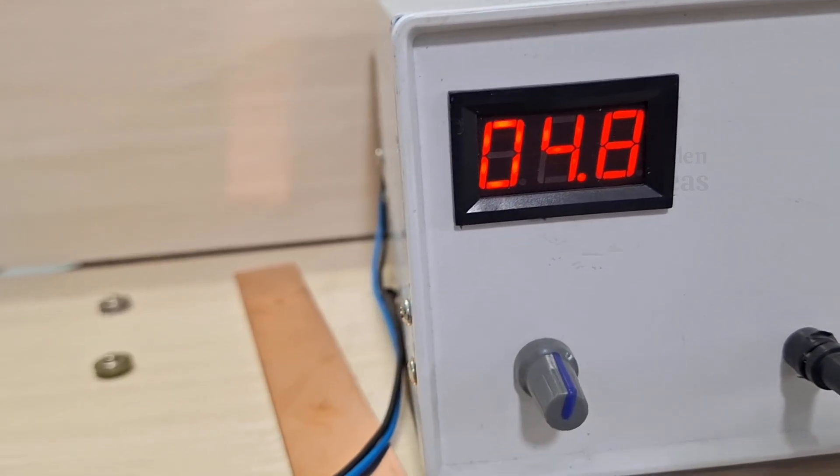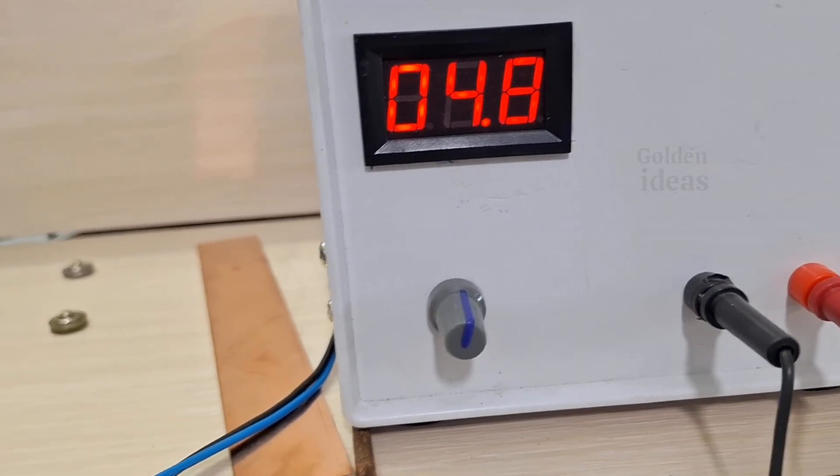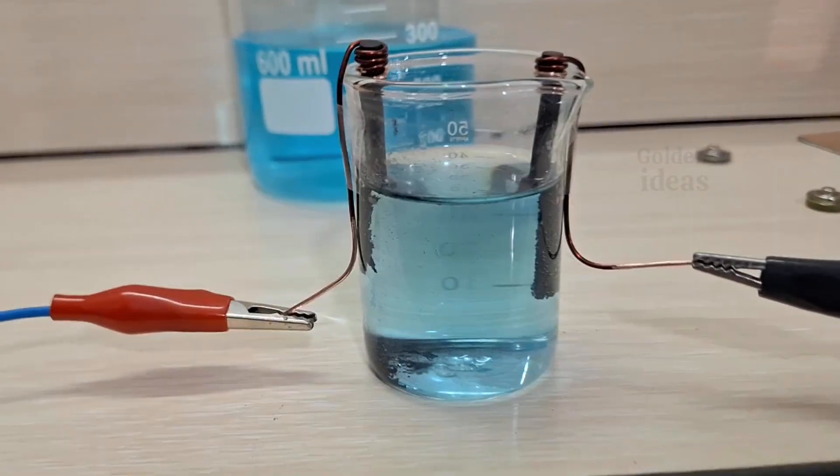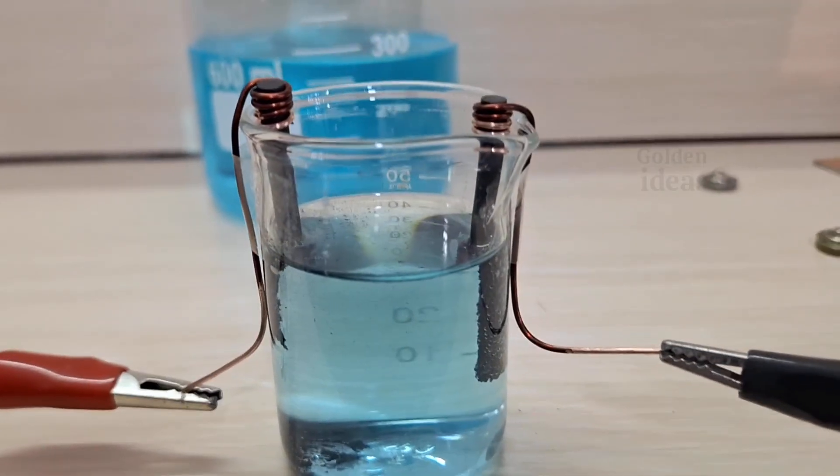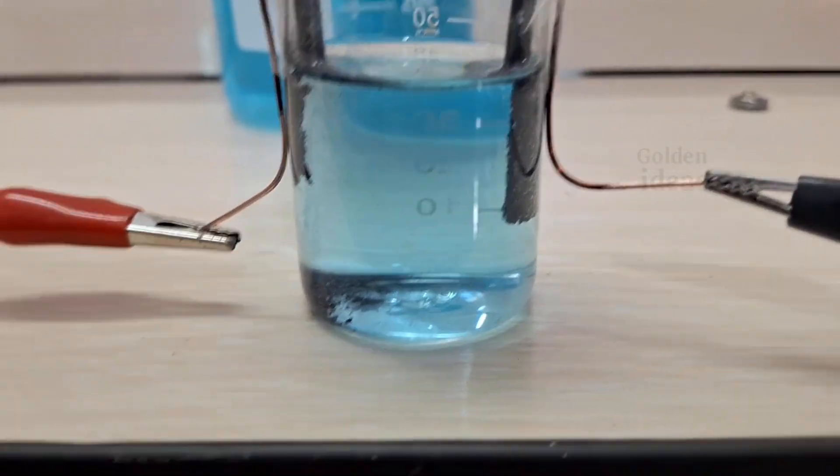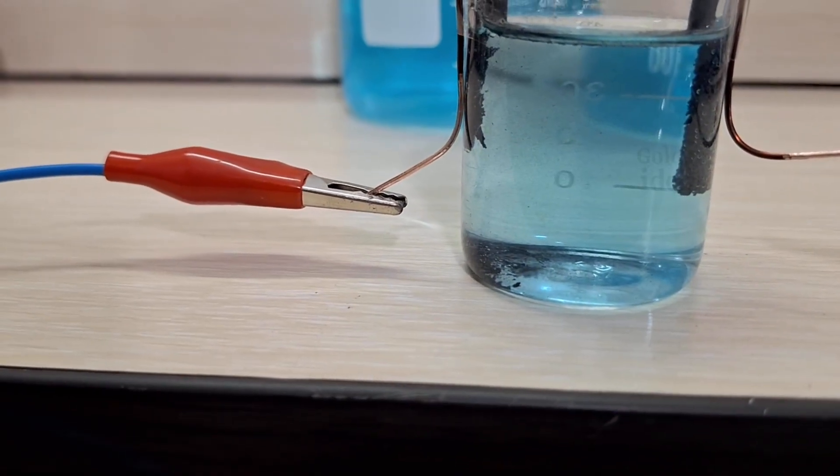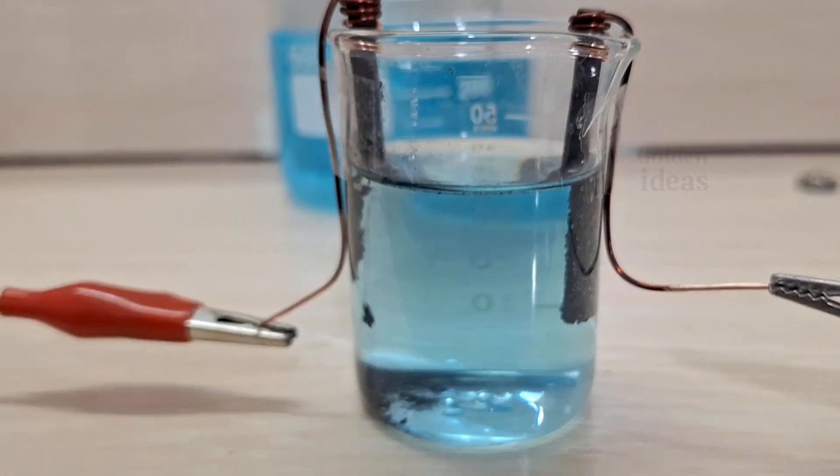Let me check the voltage. Yes, it's set to 5 volts. Interestingly, there's a fine powder forming on the graphite rod connected to the positive terminal, but it's settling at the bottom. We'll need to give it a bit more time to see what exactly is happening.